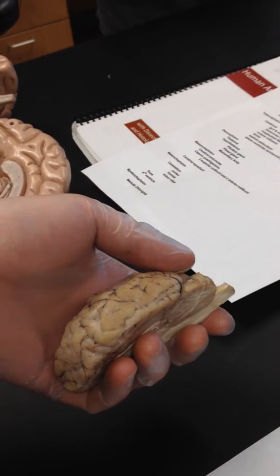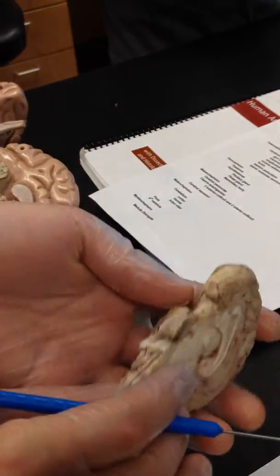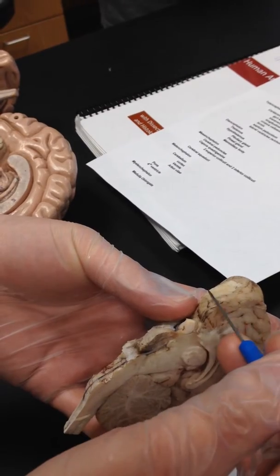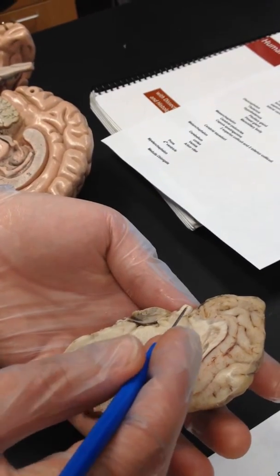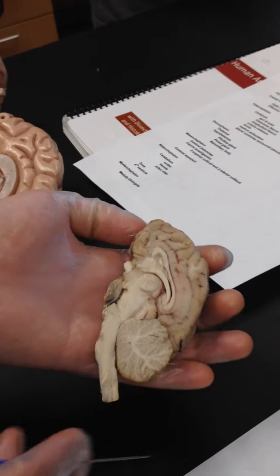And then cranial nerves, 2 on the sheep brain. We need to know these 2 here, right? The olfactory is right here. Then right behind it, you can see the optic chiasm, or the optic nerve. I don't know if I'm saying chiasm right. We'll just go through the list.